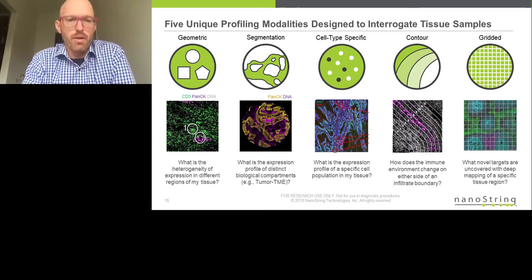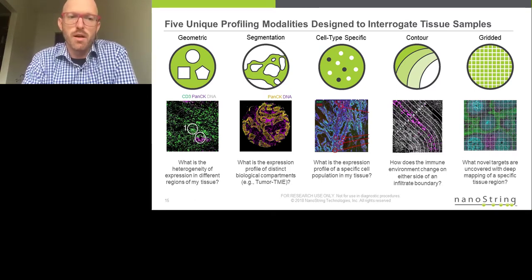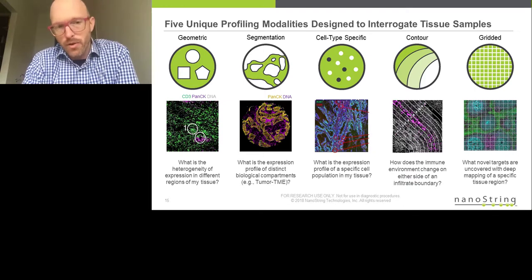So, putting them in regions with a heavy amount of infiltrate or positive for a particular signal or a particular morphological feature, such as a part of the anatomy. They can simply move these circles on top of it or shape a polygon to fit whatever they're trying to study. You can take this a step further and segment.